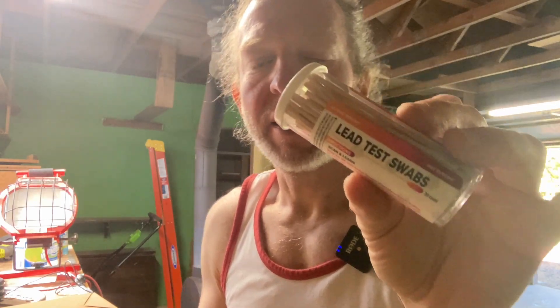Today we're gonna use these lead test swabs to test lead on some vintage weights I'm restoring. I don't think these have lead — I'm pretty sure they don't — so the test should come out negative, but let's go ahead and try it.